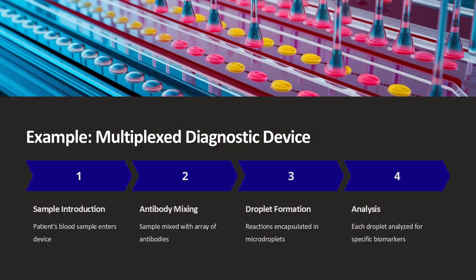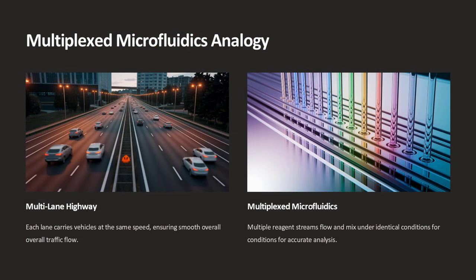In one study, scientists used a staggered herringbone mixer to produce quantum dots with exceptionally narrow size distributions, directly correlating the efficiency of the mixer with the optical properties of the resulting nanocrystals. In biochemical assays, precise mixing is crucial for enzymatic reactions where reaction kinetics are sensitive to reagent concentration.